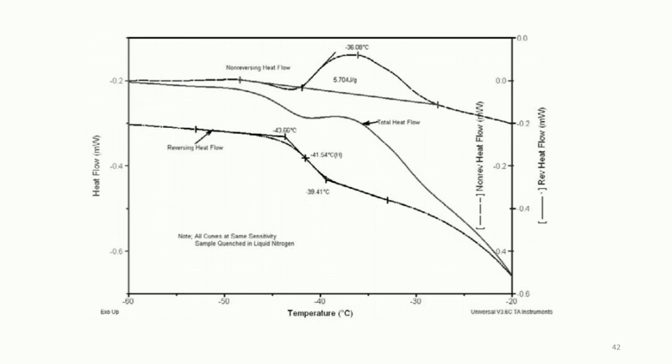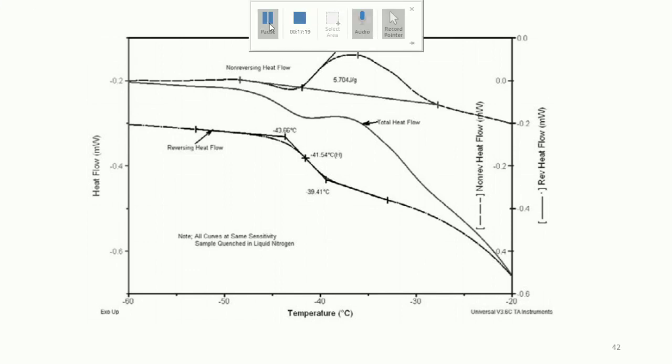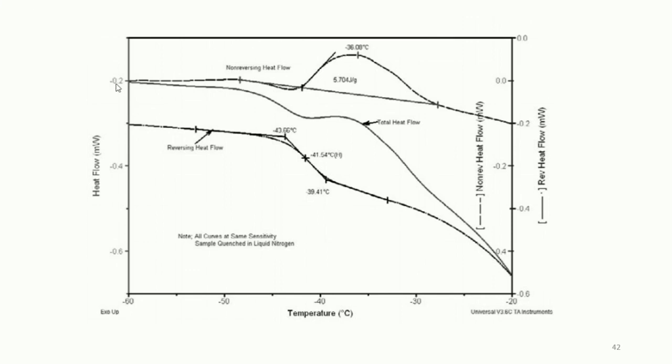The average rate provides information equivalent to traditional DSC, while the modulated heating rate provides unique information about the sample heat capacity. Moreover, traditional differential scanning calorimetry provides a single signal which is the sum of all thermal events occurring within the temperature range of the experiment.